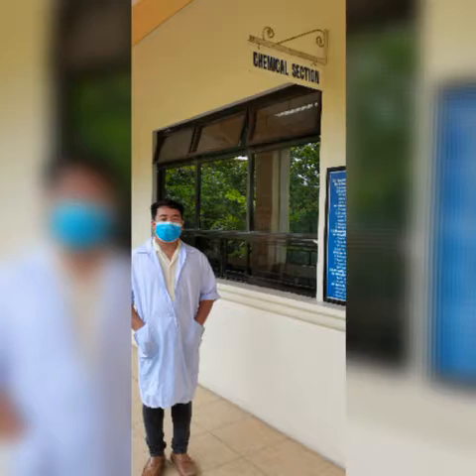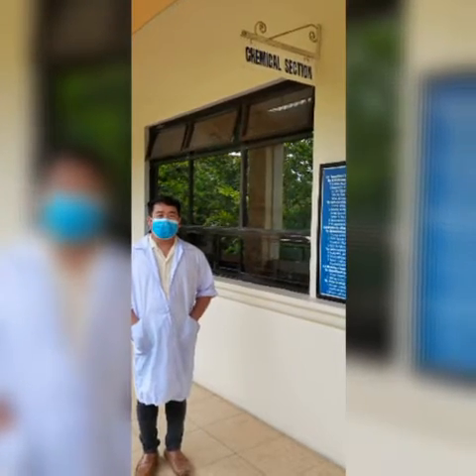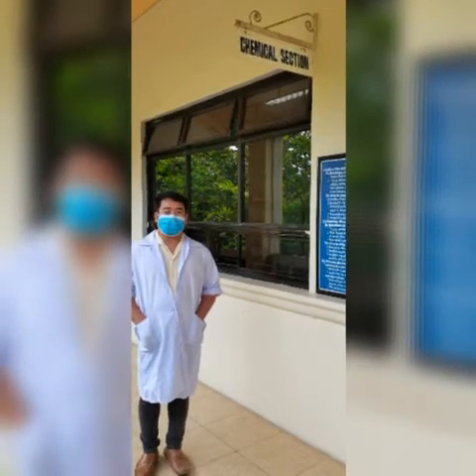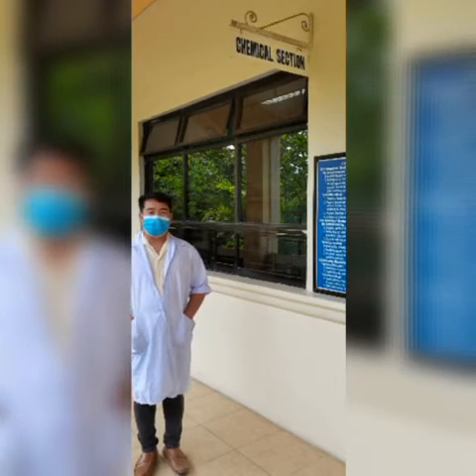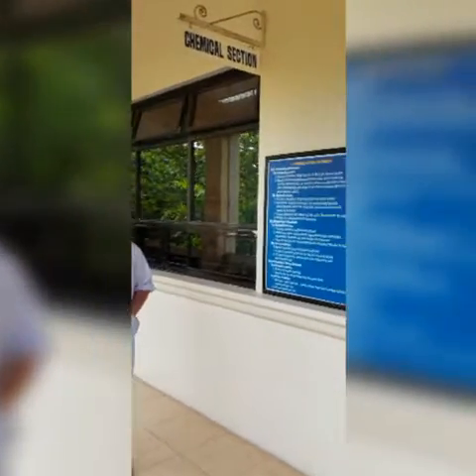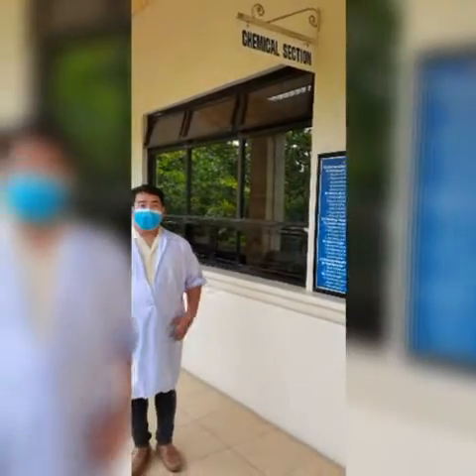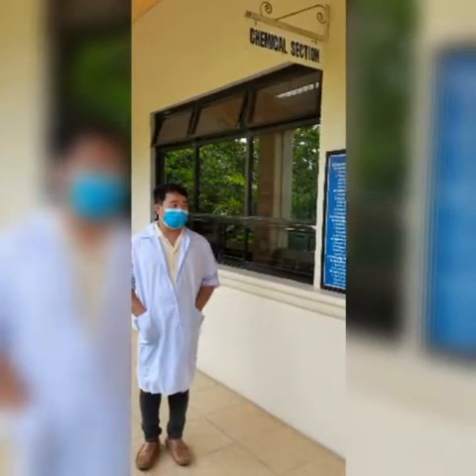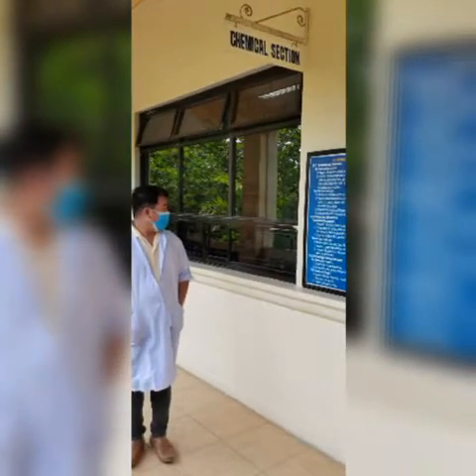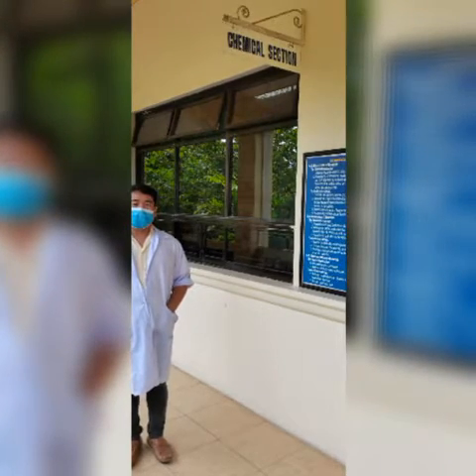Welcome to the chemical section. At the chemical section, we can find different chemicals ranging from organic to inorganic chemicals. This laboratory is equipped with safety devices in order to protect the personnel working inside this laboratory. Here you can find the flow process of the laboratory, the procedure on how to make reservations for chemical use, and also how to return the excess chemicals. And inside, we can find the different laboratory chemicals, how they are arranged in cabinets.